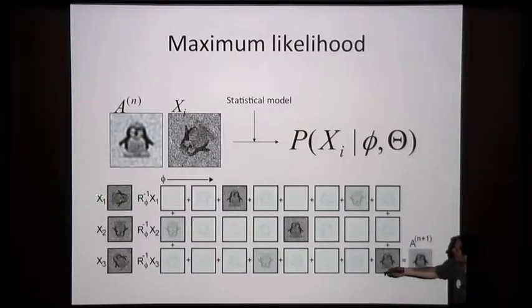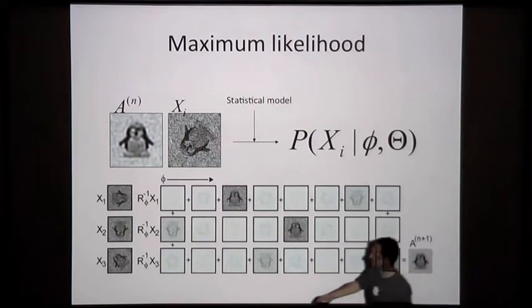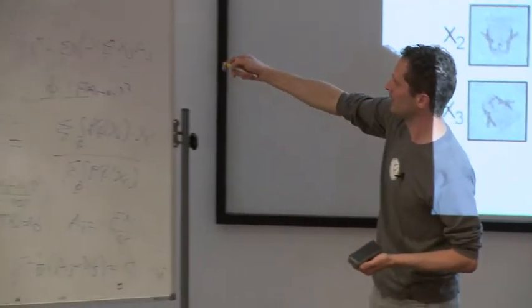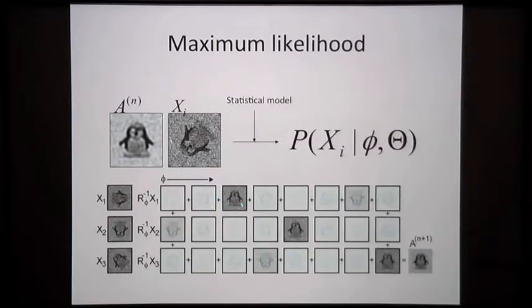If your penguin is lying sideways, the probability of observing the penguin in this orientation, if this would be your reference, would be very low. That is why it's rather transparent. Only when I start rotating it does the probability get a bit higher, because this looks more like my reference. Only when it's in the right orientation does this squared difference which we had there become small, and thus the probability becomes large. Then it goes down, perhaps upside down, because it's not that different at very low frequency from upside up, and gets some kind of intermediate probability.